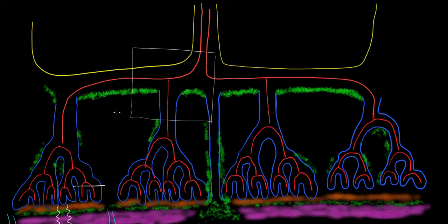Hi, this is David, and I'm going to continue on in relating the placental topology to the section that the pathologist looks at.